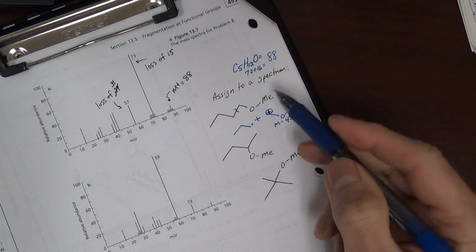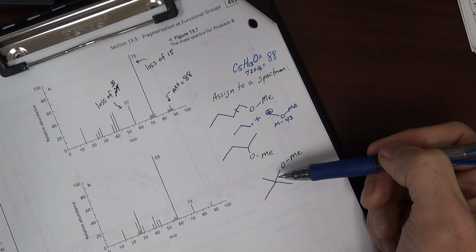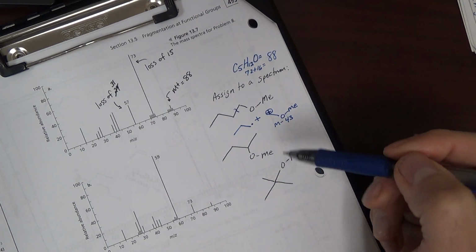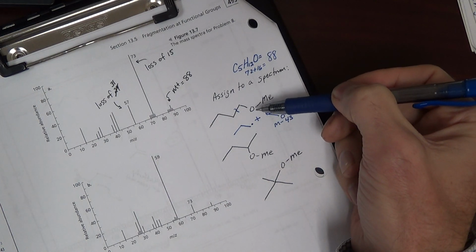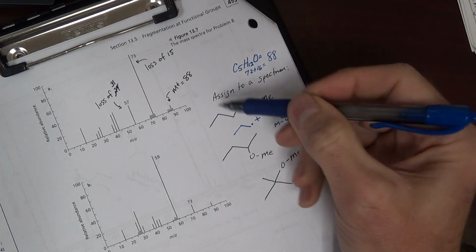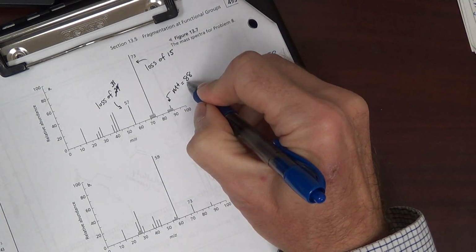And if we look at the other 2 compounds, they each equal 88. So actually the fact that the mass is the same is not going to help us, because the mass spec does show an 88.